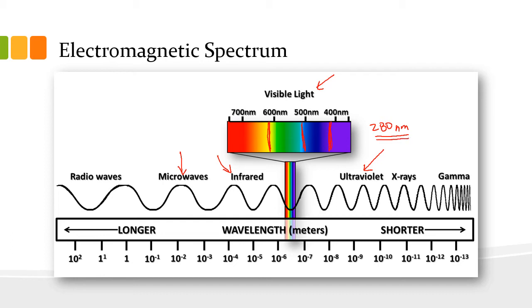So our spectrophotometer, we can set for a particular wavelength, and we can measure absorbance at all these wavelengths of interest. We could look at lots of others to look at different properties in wine, but we are looking at phenolic compounds in wine, polyphenolics, and these 4 wavelengths, and I'll mention them again, are key.